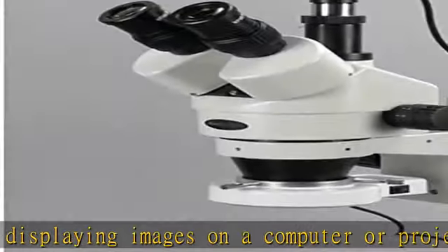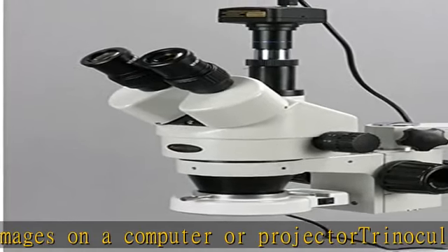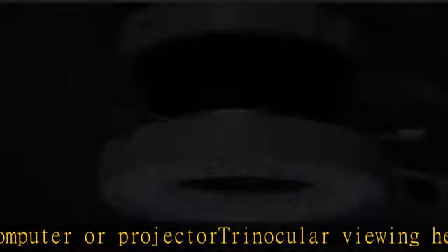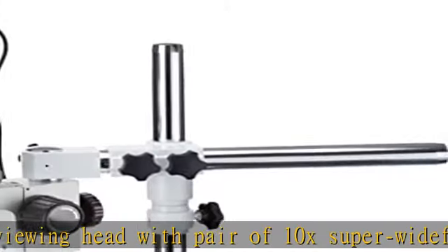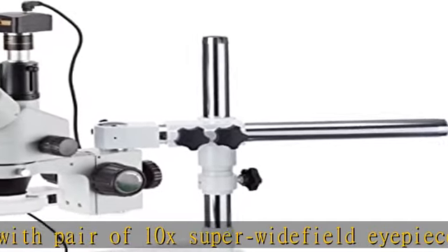Single boom arm with 8 inch vertical working distance and adjustable 16 inch boom arm enables users to adjust the microscope on the X and Y axis.